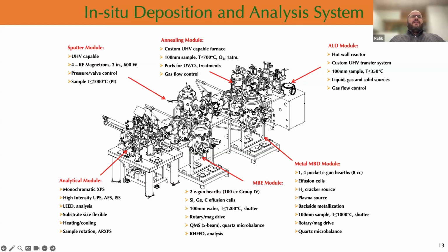Here is another deposition chamber, but it is by sputtering. We have up to 4 targets that we can use to sputter materials. For now we have hafnium, titanium, tungsten, and tantalum, but we have more than 25 targets in storage.